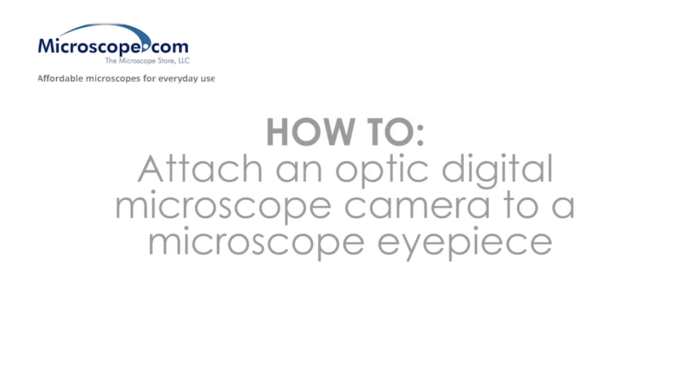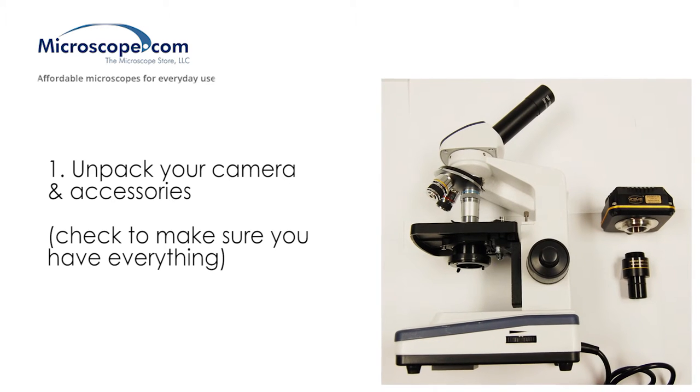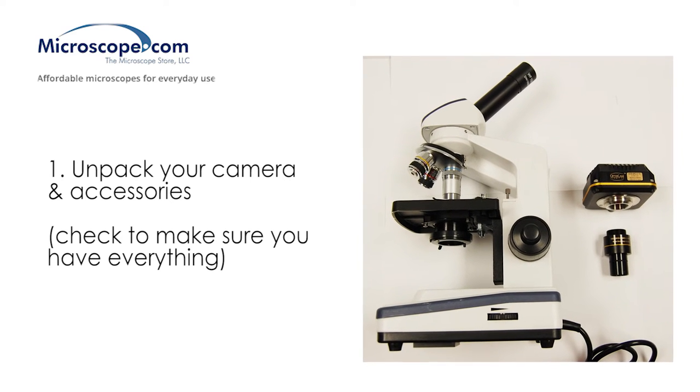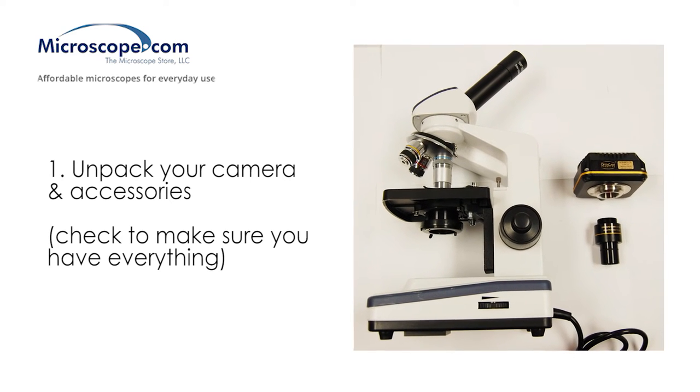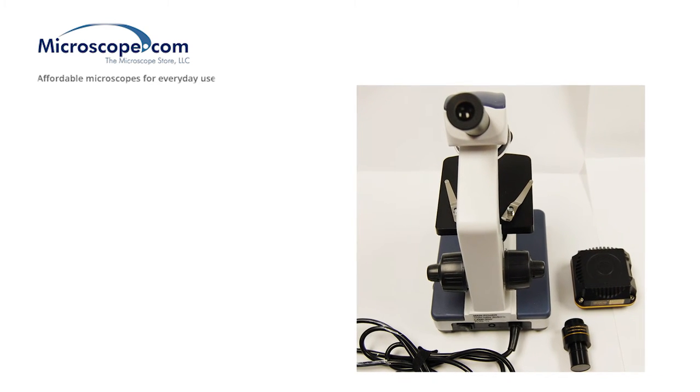In this video, we will show the process of attaching an OpticsCam digital microscope camera to a microscope eyepiece. First, unpack your camera and accessories, and make sure that you have all the needed items. The camera itself and an optical adapter are needed to connect to the ocular or eyepiece tube of a microscope.